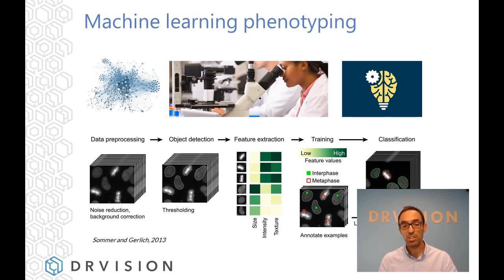The software will learn those features for a particular class, and when you train, you are creating, in our case, a random forest. I do suggest you go and see the webinar with the full explanation, but the random forest is a combination of decision trees, and each decision tree is created by randomly sampling the data points, and then at each decision tree branch it randomly samples the features that it uses to teach that tree.